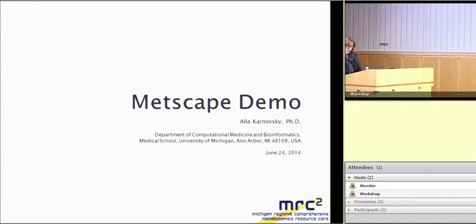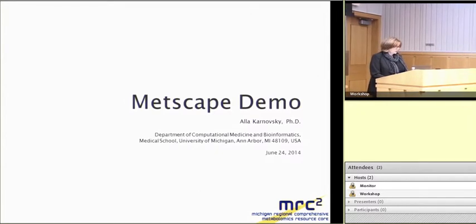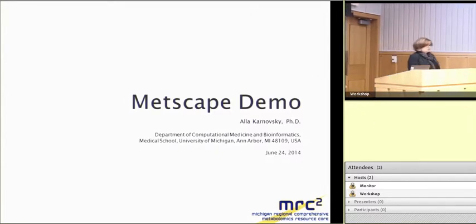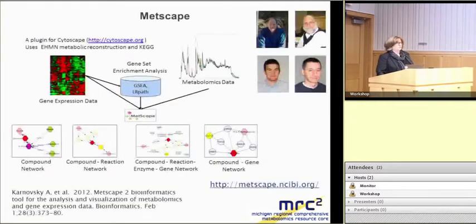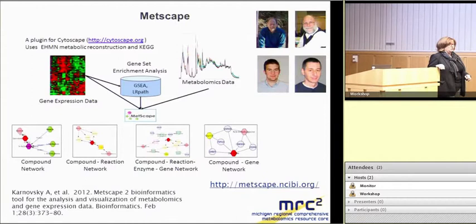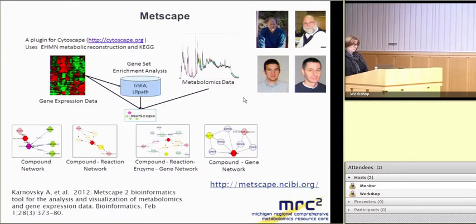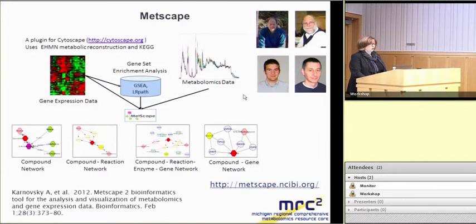But basically today, as promised, I was going to focus on our tool MetScape, and I will try to point out the things in the workflow that were mentioned in Barbara and Chuck's talk, and essentially explain to you guys what we're doing to try and extend that workflow so you can go from a tool like CoolMap to MetScape and so on and so forth. But I'm going to start with the basics, and this is the slide that I showed yesterday. And I briefly explained the workflow, so I'm just going to tell you what I'm going to focus on today.